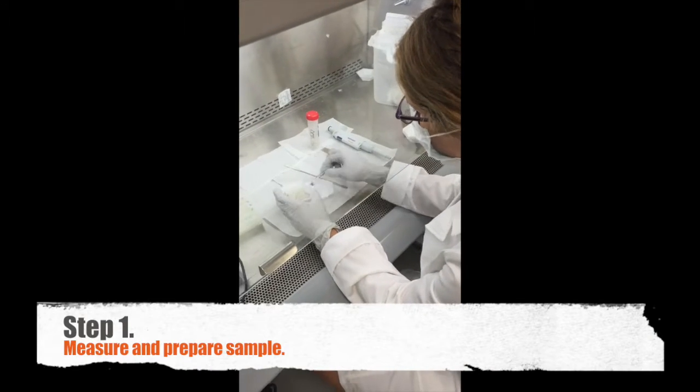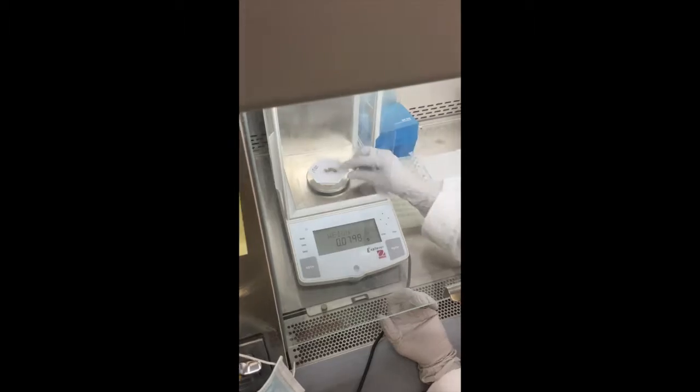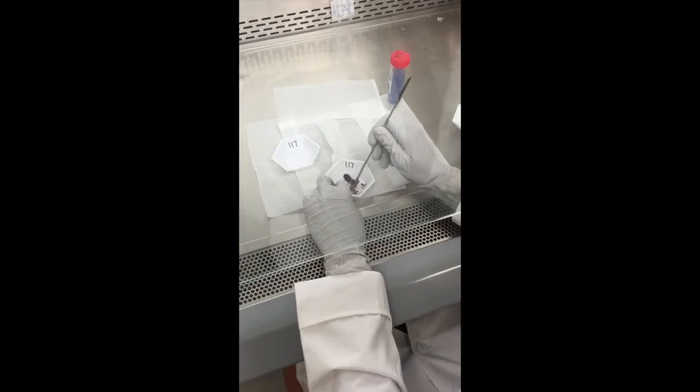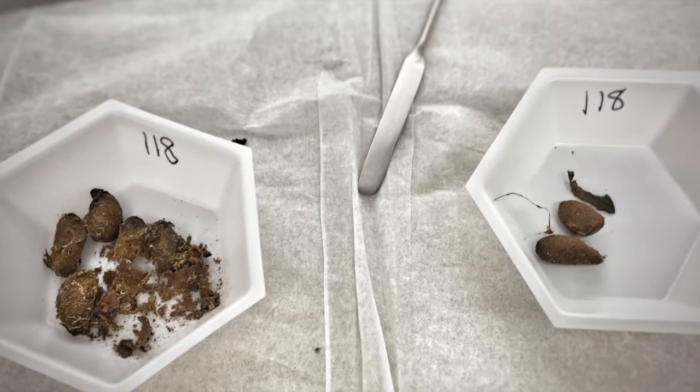Step one: I measure a very small amount of the dried sample. I use bleach-washed tools to very carefully scrape and grind the poop while I try to pick out any other materials like seeds or bugs.